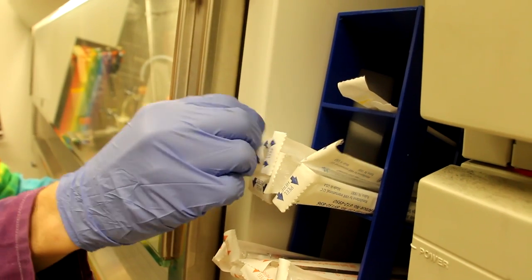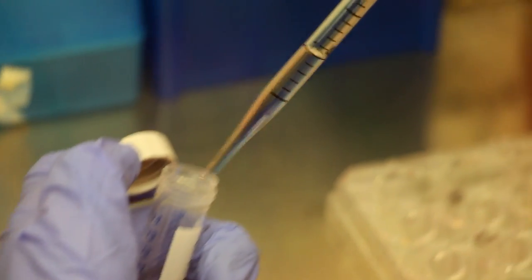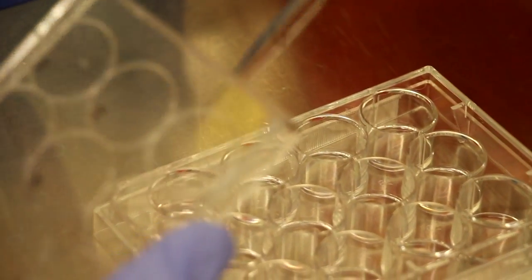After you've aspirated the media from your 12-well plate, go ahead and add 1 ml of fresh growth media to one of the wells. This will serve as an untransfected control.